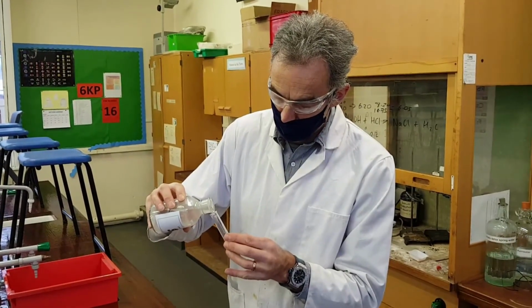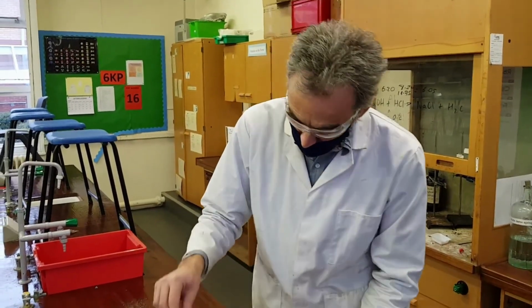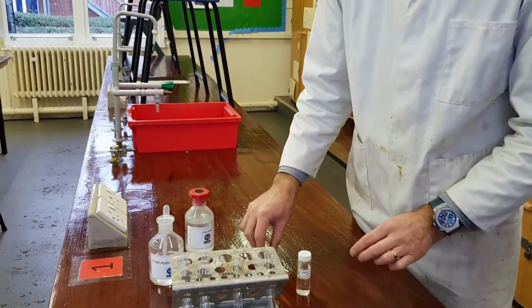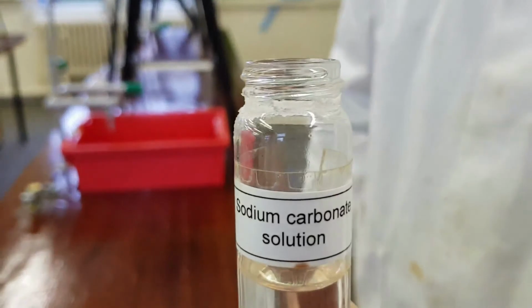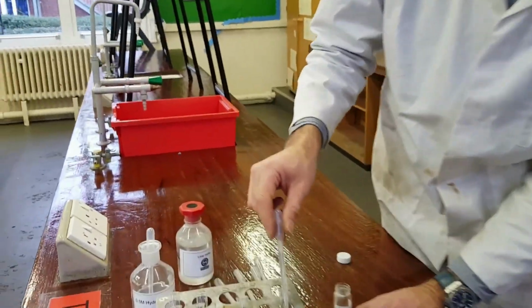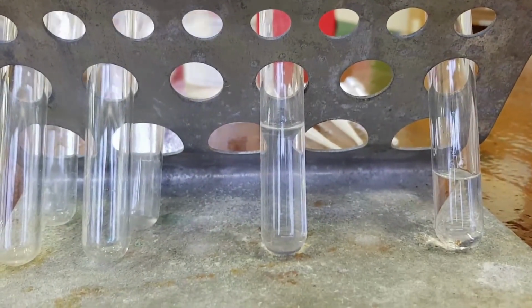So the first thing Mr. Reeves is doing is putting about 1/3 of a test tube full of lime water into a rack ready to be used, and we're going to do our test on some sodium carbonate solution. So again, we don't need a huge amount of this reagent. So putting some carbonate into that test tube there.